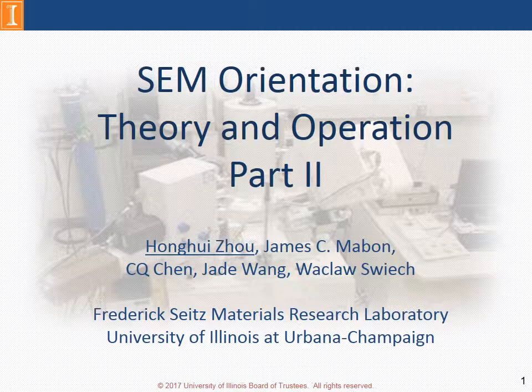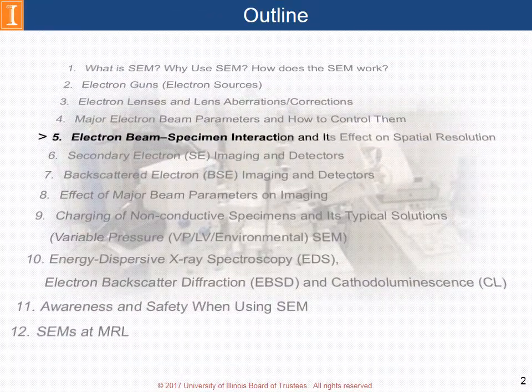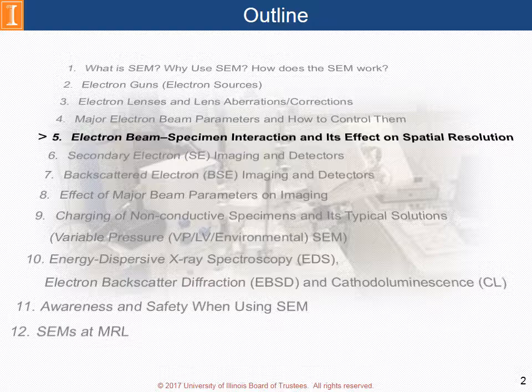Hi, welcome back to the Materials Research Laboratory Scanning Electron Microscopy Orientation seminar. This is part 2. In this part we will start with the interaction between the electron beam and the specimen, as well as its effect on spatial resolution.